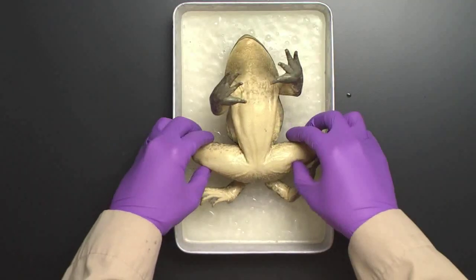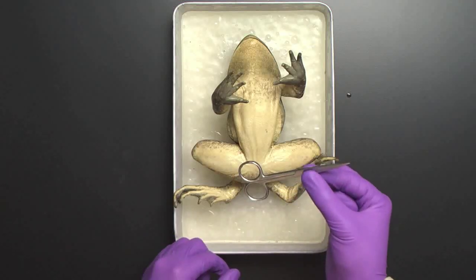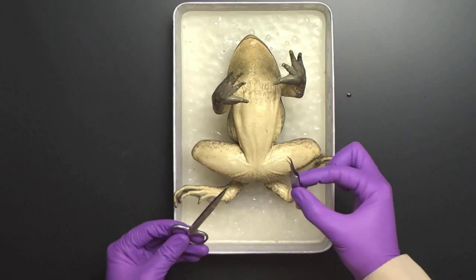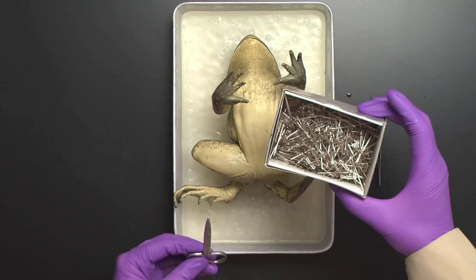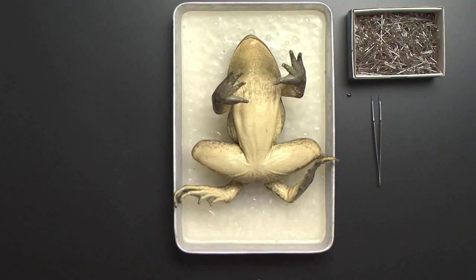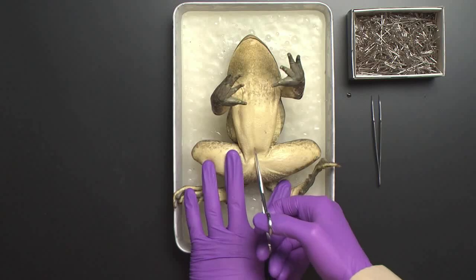Before starting, I would encourage your students to put on safety glasses, gloves, and aprons and grab their dissection tools. All you'll really need is a pair of dissecting scissors and a pair of forceps for pointing out special features. In addition to this, you'll also want some T-pins to help pull the frog and keep it in place if you're using one of our dissection trays.